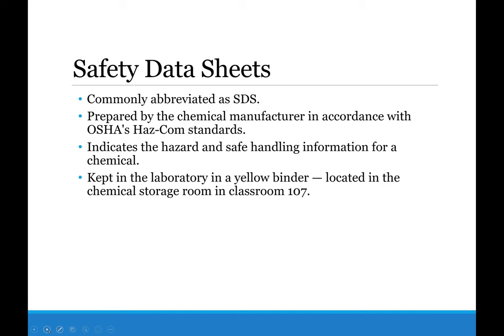Safety data sheets, commonly abbreviated as SDSs, are prepared by chemical manufacturers to OSHA's HazCom standards. They indicate the hazards a chemical can pose and how to safely handle it while in use. We keep safety data sheets for all of our chemicals in a yellow binder located in the chemical storage room in classroom 107. I will show you where everything is in the laboratory when we go in for experiment one.